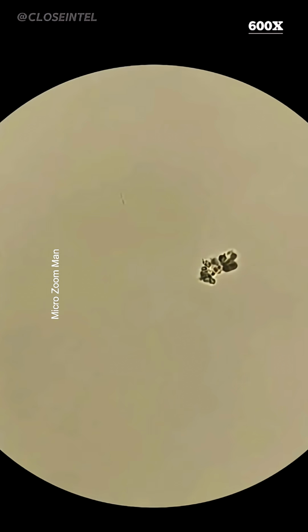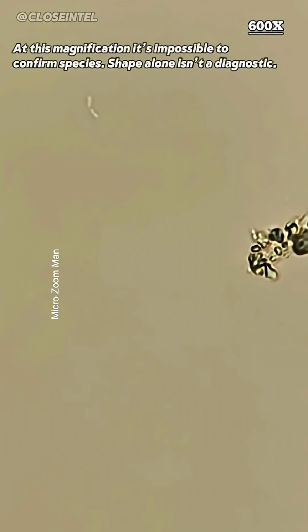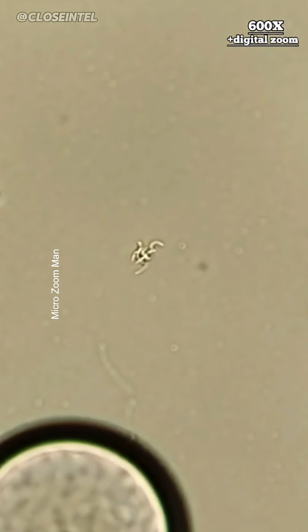Interestingly, I did spot what might be a couple of rod-shaped forms that resemble bacillus bacteria near some debris. However, it's important to note that bacteria are all around us. They're found almost everywhere. Seeing a few isolated bacteria in a concentrated, settled sample is pretty normal and not something to worry about. The treatment process significantly reduces their numbers, so finding a couple of stragglers isn't a big deal.